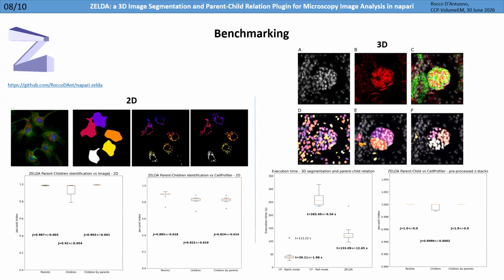I will explain later how the functions that are used inside the plugin can also be used in a Jupyter notebook in order to do batch processing of data. So the goal of the plugin is simply to see visually how the result would look using Python libraries in order to segment objects and relate them. And one can think of later writing a Jupyter notebook using the same parameters that have been used in the graphical execution and try to run batch analysis.